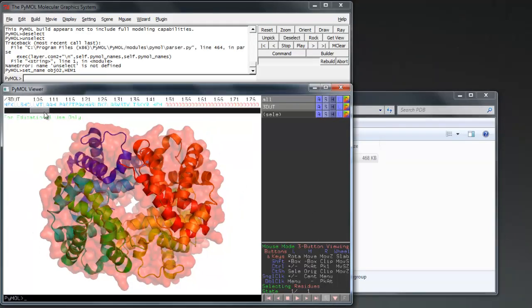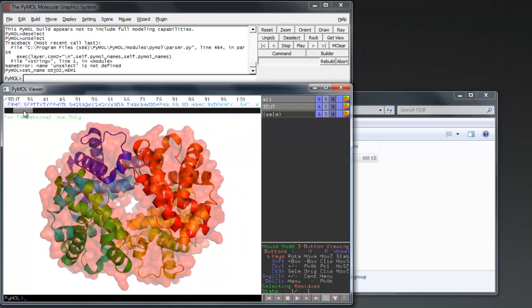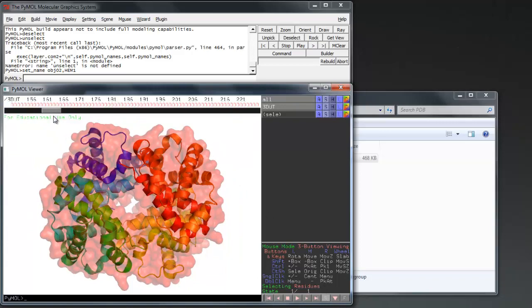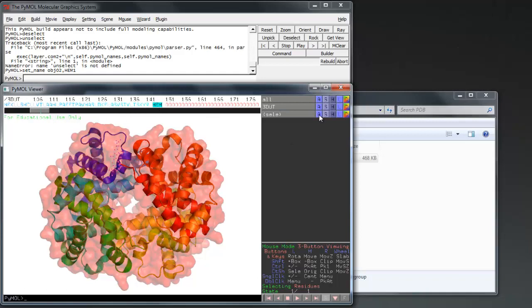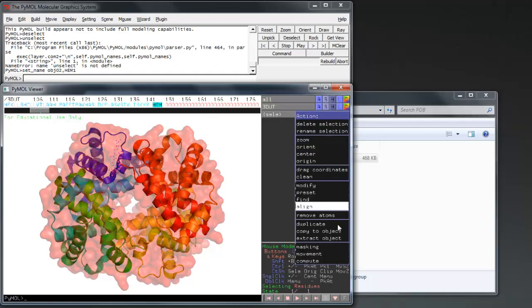Let's add some more detail to our protein. Pressing the S button at the bottom right hand corner of the screen will open up the amino acid bar above our protein, allowing us to explore the residues within.